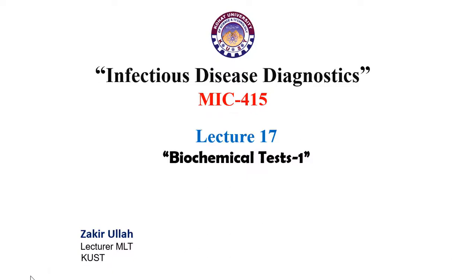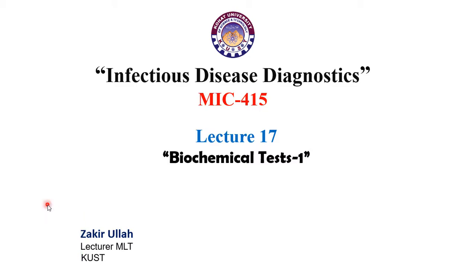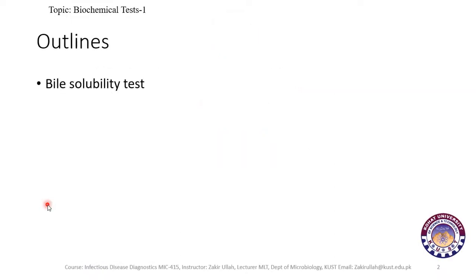Bismillah ar-Rahman ar-Rahim. This is an overview about the different types of biochemical tests which we have discussed in the overall 3 lectures. In the first lecture we discussed the bile solubility, catalase and coagulase tests.